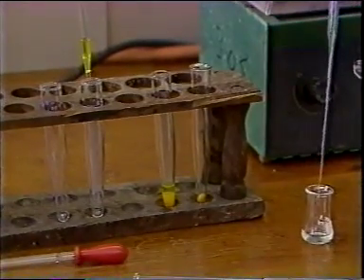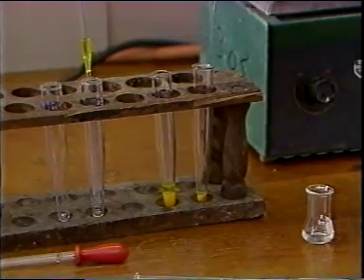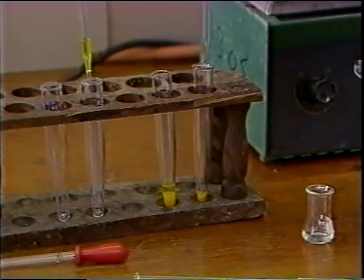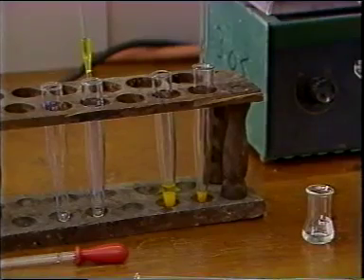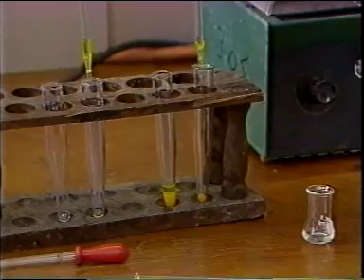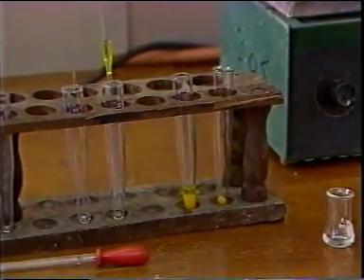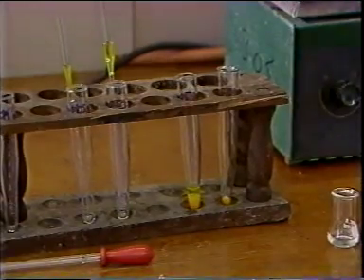The crystals can now be washed and the process repeated. And if necessary, a further recrystallization can be carried out in the same tube.